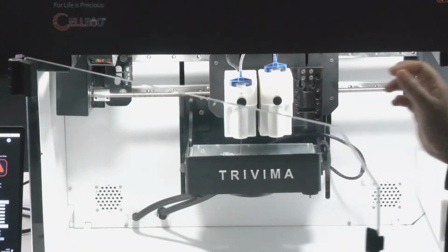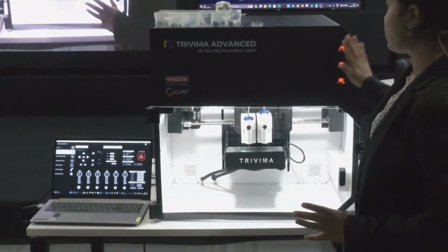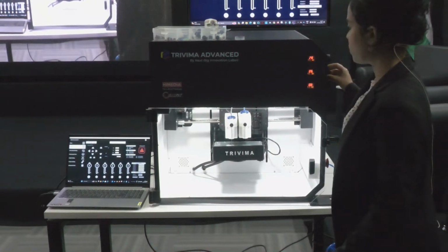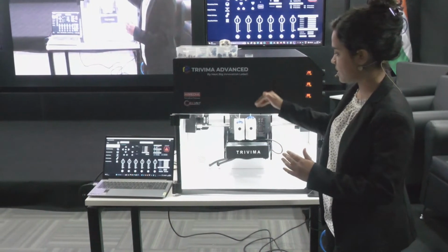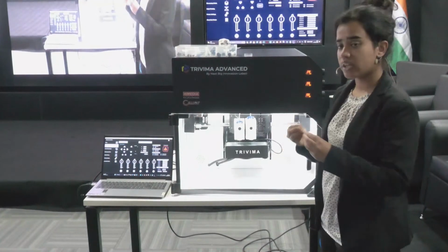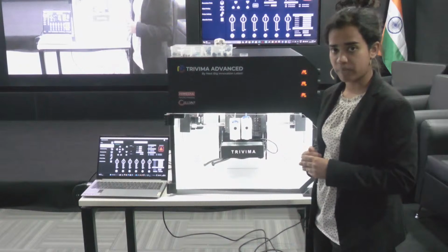The compressed air that is supplied to the bioprinter is controlled using these manual pressure gauges. With this, you would be able to rotate and control the precise pressure at which compressed air is supplied, which would define the kind of bioink or the amount of bioink that will be bioprinted onto the print bed.